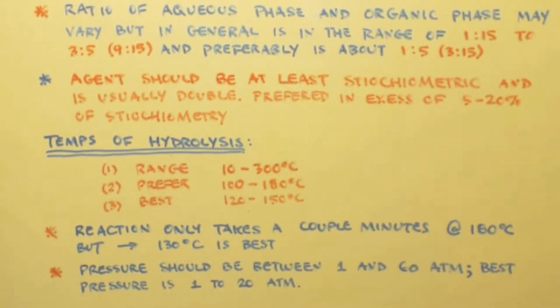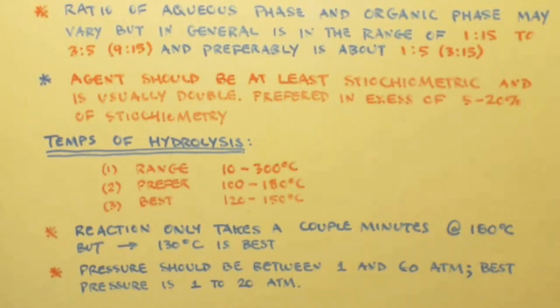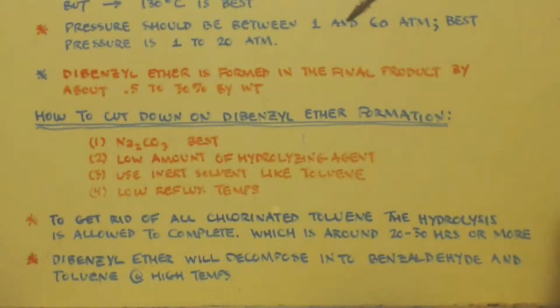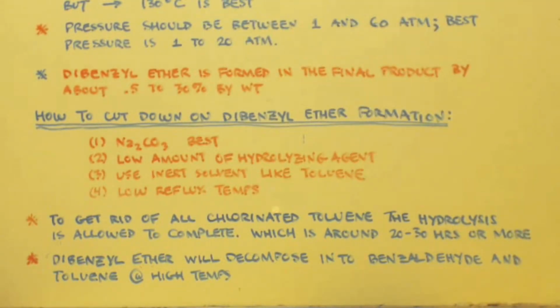What's the best pressure? Well, the pressure should be between 1 and 60 atmospheres. Best pressure would be 1 to 20 atmospheres. Now I'm going to do mine at atmospheric pressure, so that's 1 atmosphere, so that's within the best. So the pressure is 1 atmosphere. Another thing is dibenzyl ether is formed in the final product by about 0.5 to 30% by weight. So when you get done, anywhere from 0.5% to 30% of your stuff has been transformed into dibenzyl ether.